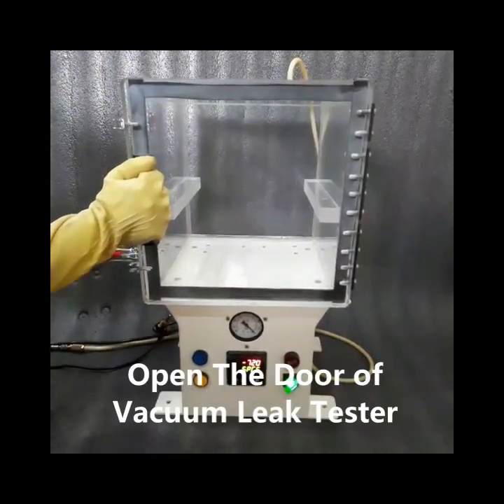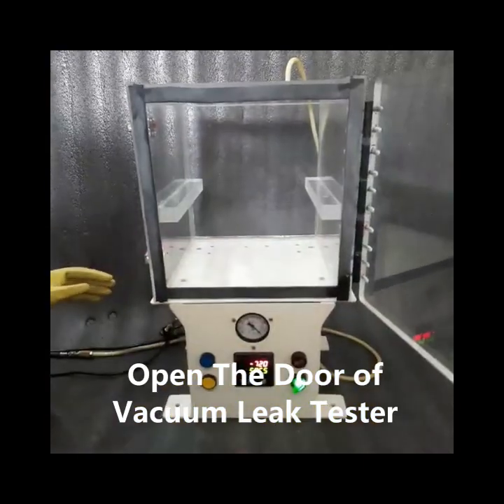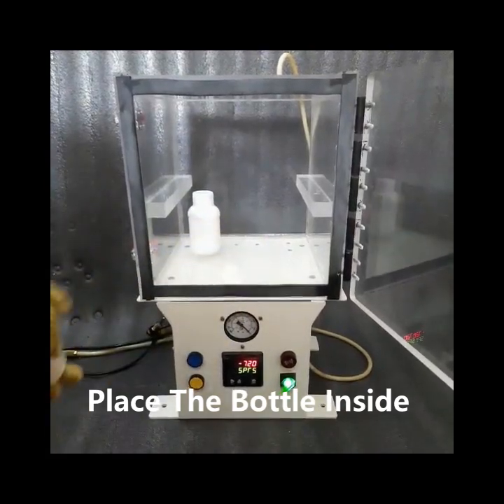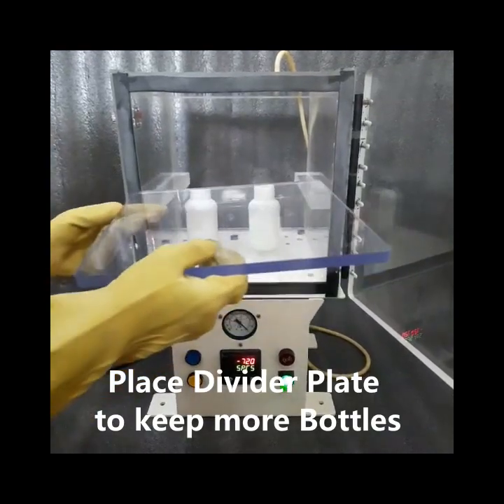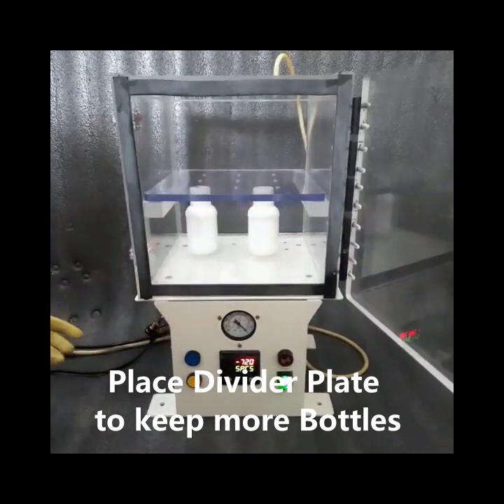Open the clamps. Now open the door of the vacuum leak tester. Place the bottle inside the vacuum leak tester. Place the divider plate to keep more bottles.